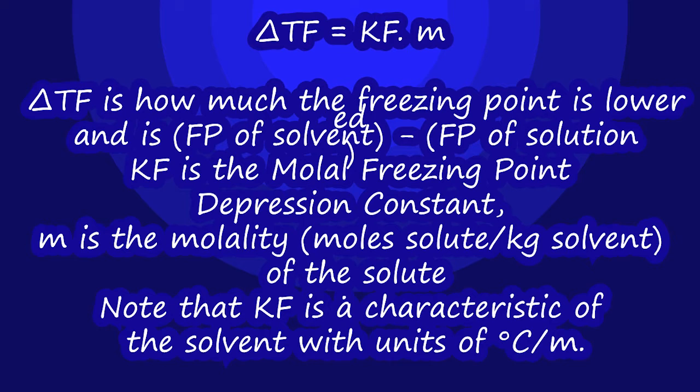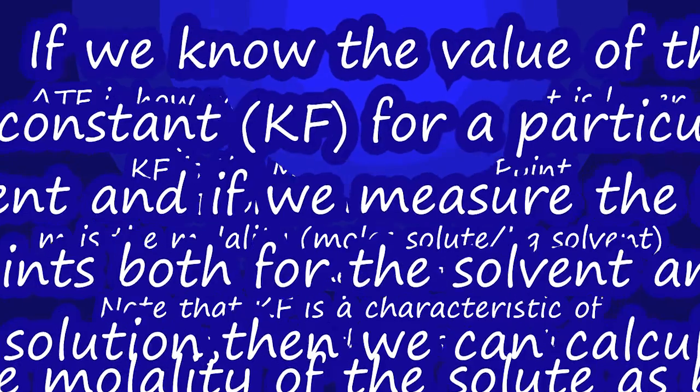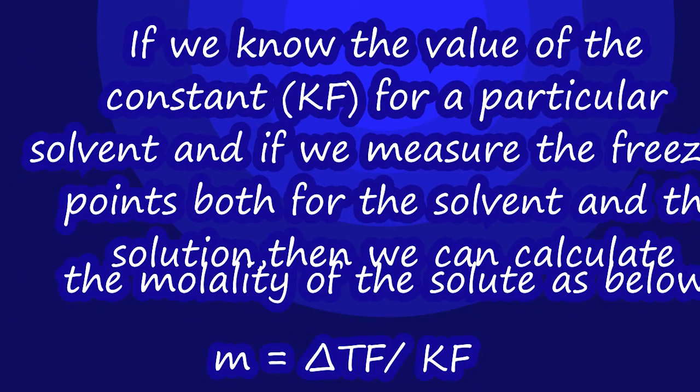So in your calculation, when you have the mass of the unknown and the number of moles, just like the last experiment, you can calculate the molar mass. If you look at the theory or the background for this experiment, it's basically talking about colligative properties, which we already talked about, and vapor pressures and other colligative properties.